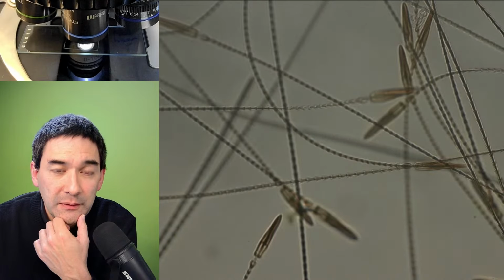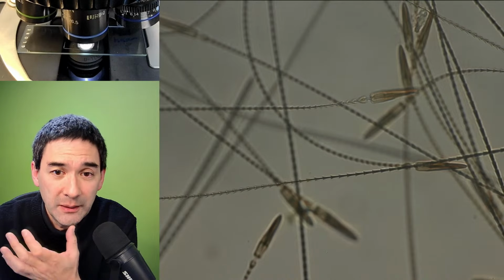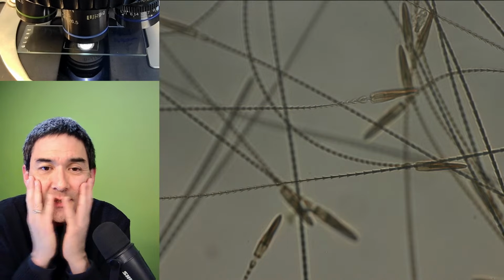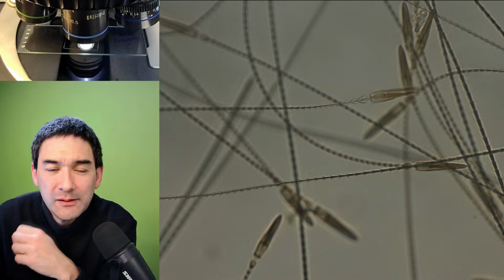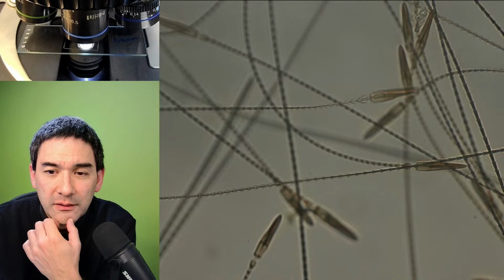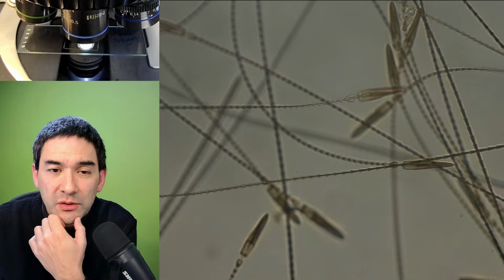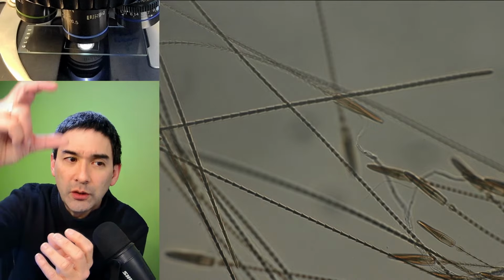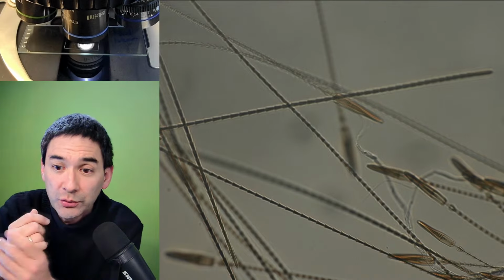What fascinates me a little bit is how in the world do they even grow? They appear to be non-cellular, right? So that's the question. I don't know if the top part grows and as it becomes longer, I really don't know.